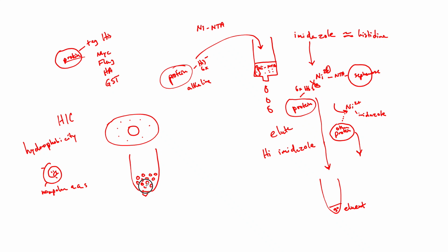They're a different kind of bead. They're white in color, and they're relatively hydrophobic. And so if you have a protein that is highly hydrophobic, it will bind very well to these beads in an aqueous solution, in water. Because of course, hydrophobic things want to get out of water, and so if they are in water and they come close to each other, they will associate together to try to escape water because they're hydrophobic. And so if you put something that's very hydrophobic over these beads, it will have a lot of affinity for these hydrophobic beads. Like attracts like in the case of hydrophobicity.